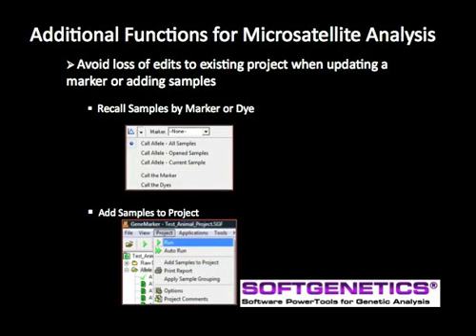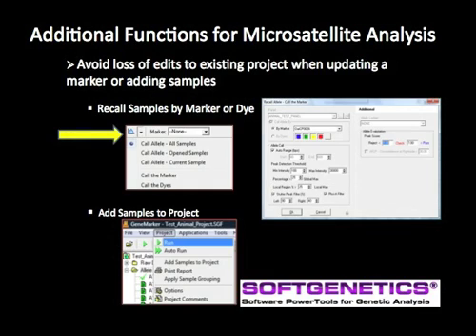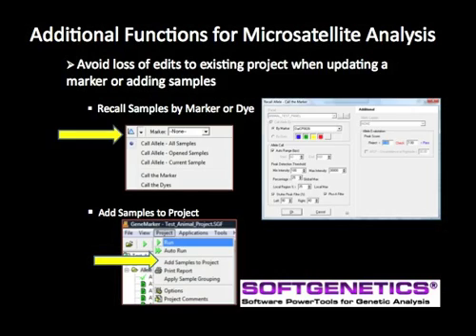Additional tools that are helpful to many microsatellite analysis projects include recall samples by marker or dye and addition of samples to a project. Occasionally, a new allele is discovered in a population after the analysis and edits have started. To recall the samples without losing previous edits to other markers, simply use the panel editor to add the new alleles to the panel and then save this panel. Return to the main analysis screen and activate the Call Allele drop-down menu. Select from the main options and then the Recall Alleles dialog box. Click OK to recall only the marker or dye selected. Edits to all of the other dyes will not be lost because these dyes were not recalled. Adding samples to a project may be used for any additional samples that were produced with the same capillary electrophoresis conditions. By using the Project Add Samples to Project option, the newly added samples are analyzed using the same parameters as the existing project. The previously made edits will not be lost; only the newly added files are being processed.